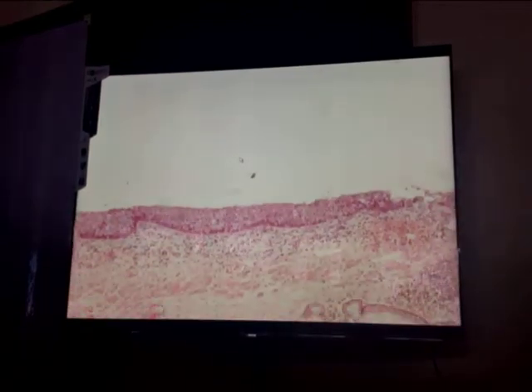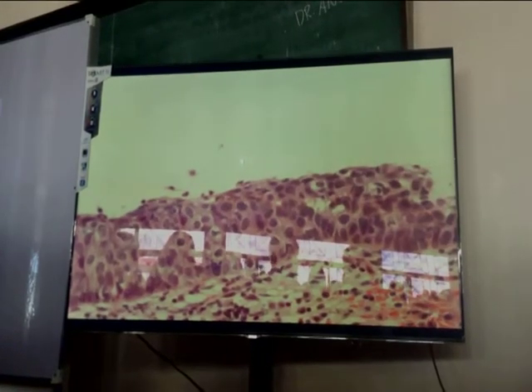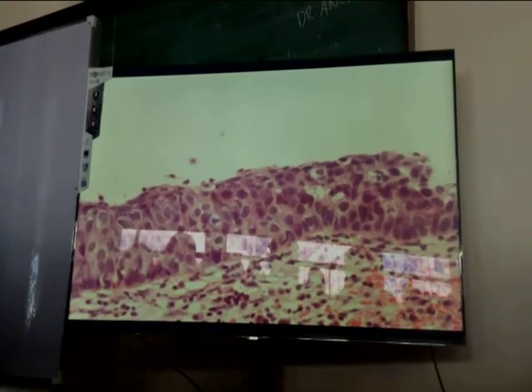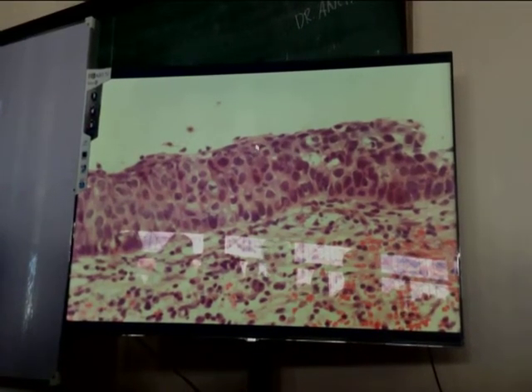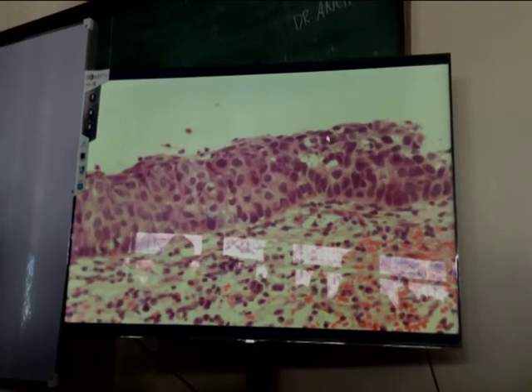So, that is why, from respiratory epithelium, nagkaroon ng metaplasia, the epithelium becomes transformed into stratified squamous epithelium. Now, can you still remember the normal maturation pattern of the squamous cells in the squamous epithelium? Normally, the cells at the basal portions will have larger nuclei. And then as the cells ascend to the superficial portion, nagkakaroon ng decrease in size of the nuclei. How about those nuclei pointed?